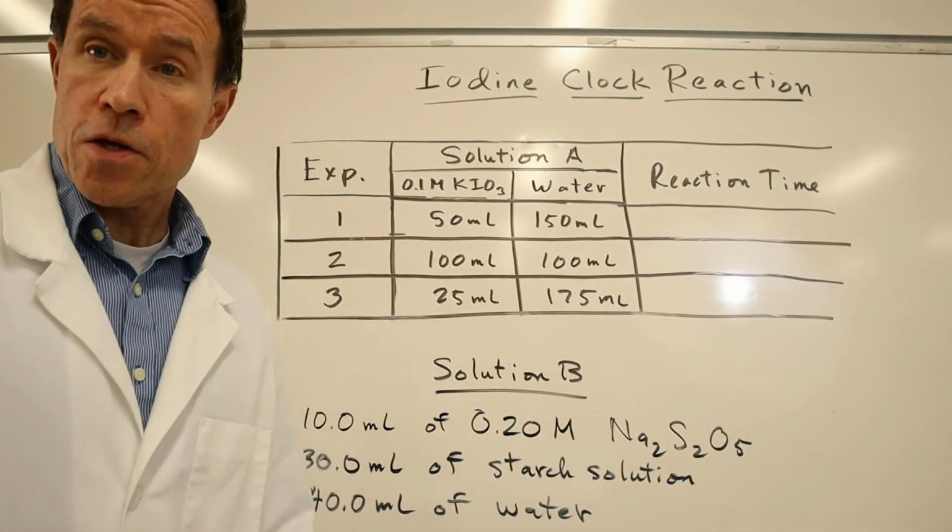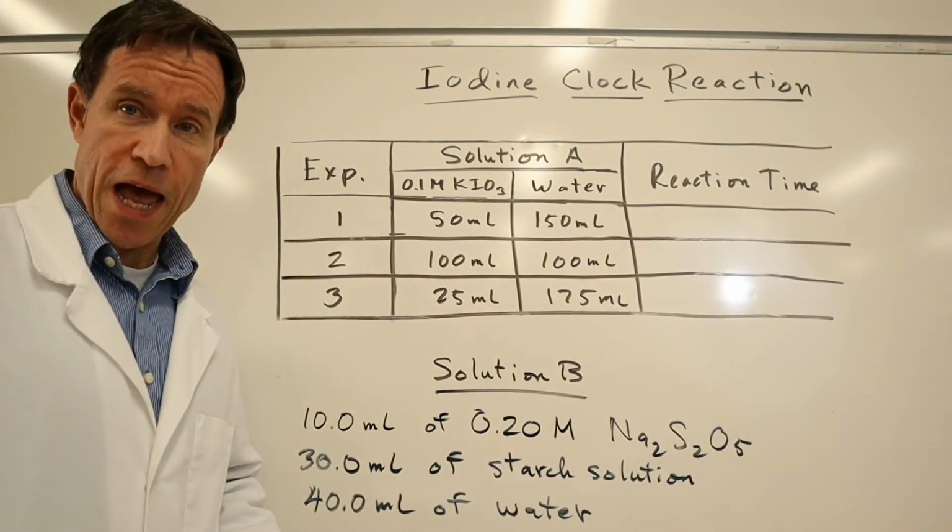So, keeping that in mind, in this particular experiment, we're going to change the concentration of the reactants and watch to see how it affects the rate of the reaction. Fasten your seatbelts, keep all hands and arms inside the cart, and you're in for a wild ride. Let's go do it. So here's the reaction. Here's what's going to happen.